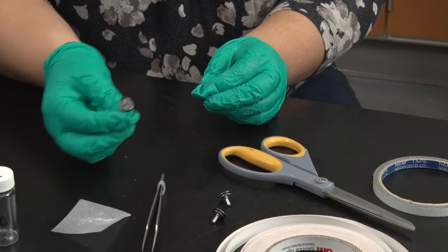This sample is traditional table salt, and you can see from this image I collected that it crystallizes into nice square crystals. Common table salt is sodium chloride, and its crystal structure is face-centered cubic, as shown here. It's easy to see how the arrangement of atoms in sodium chloride results in the small cubes that we see by SEM imaging. Now, let's move to the uncoated salt crystals.